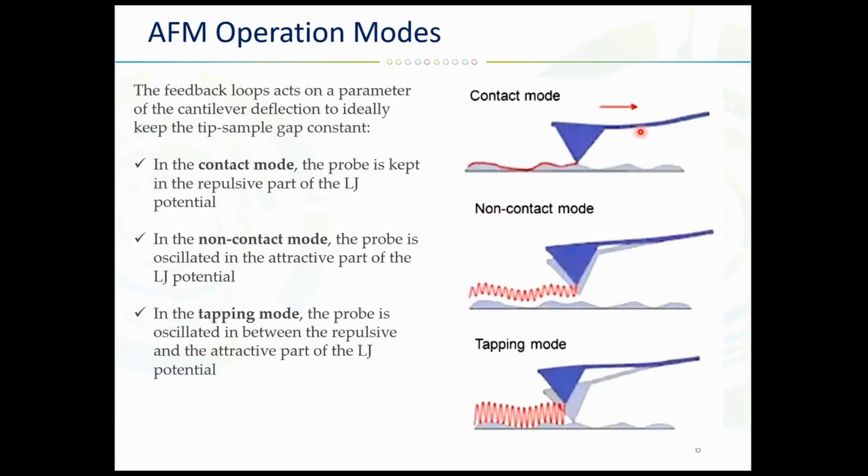If you have any capillary forces, you will be fighting with them because the tip of the cantilever will be forming a meniscus with the sample, and again, this can disrupt your measurements. Softer materials might be damaged because again, the tip is constantly moving along the surface.